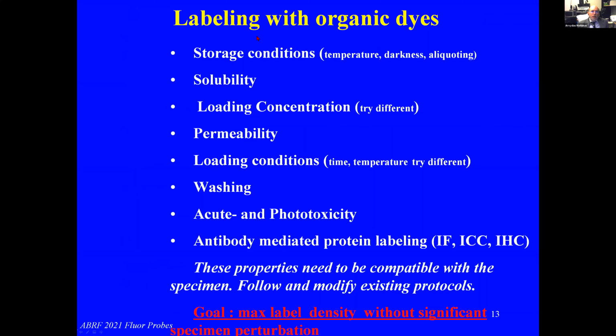So for example, while labeling with organic dyes, we should take care of the storage conditions, as Guillermo already mentioned. A 20-year-old probe, I mean, not designed 20 years ago, but sitting on the refrigerator shelf for 20 years, is definitely not good.